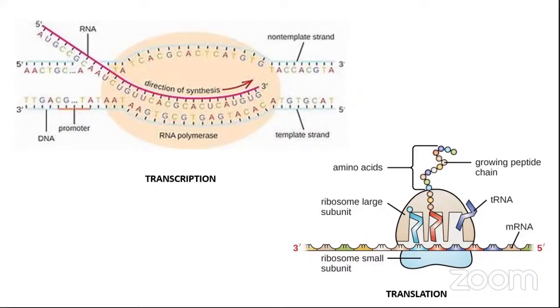Because for library preparation and data generation, it is important to know what different kinds of analysis we can do from this transcriptome data, and to do so, what steps we have to modify at different stages: library preparation, meaning data generation, pre-processing and downstream analysis.